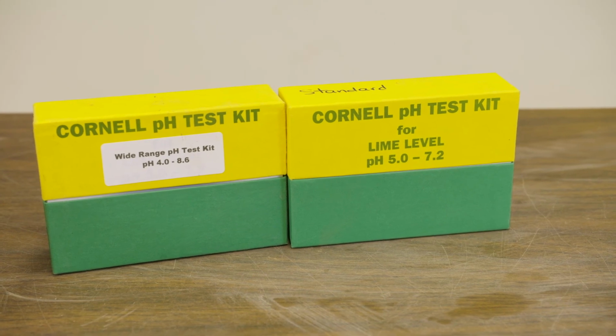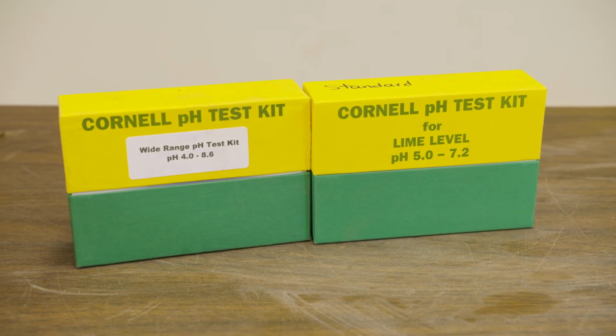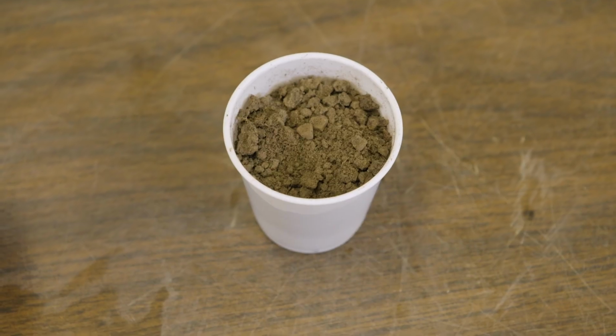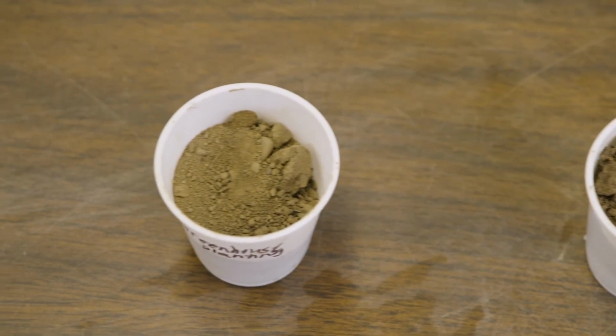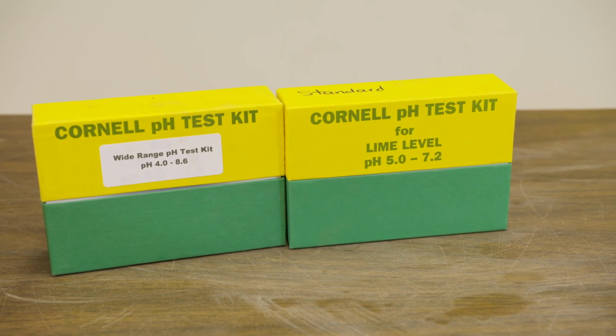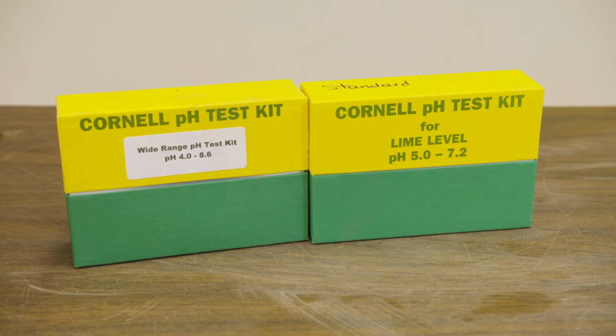The pH test is very simple. We use the Cornell pH kit, which is a colorimetric test. And we'll try two different soils. There's two parts of the kit. One is the standard, and one is a wide range. We always start with the standard.